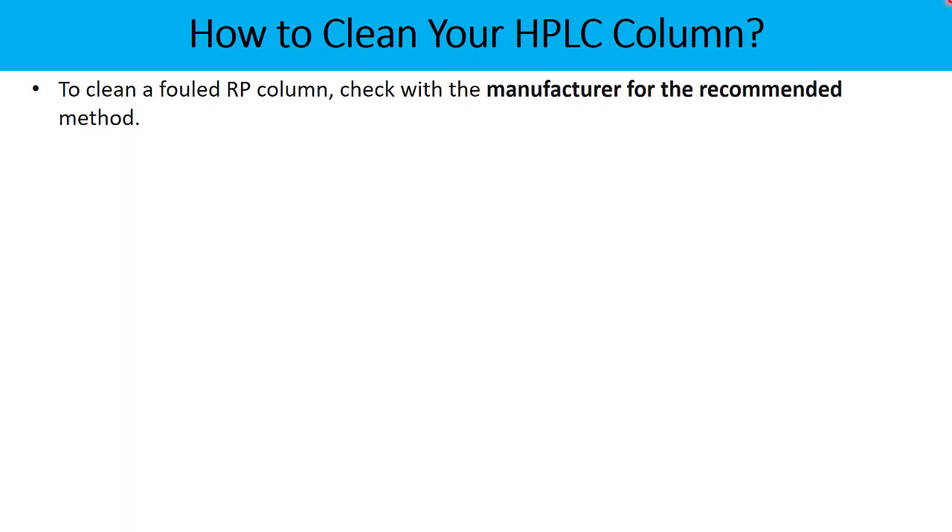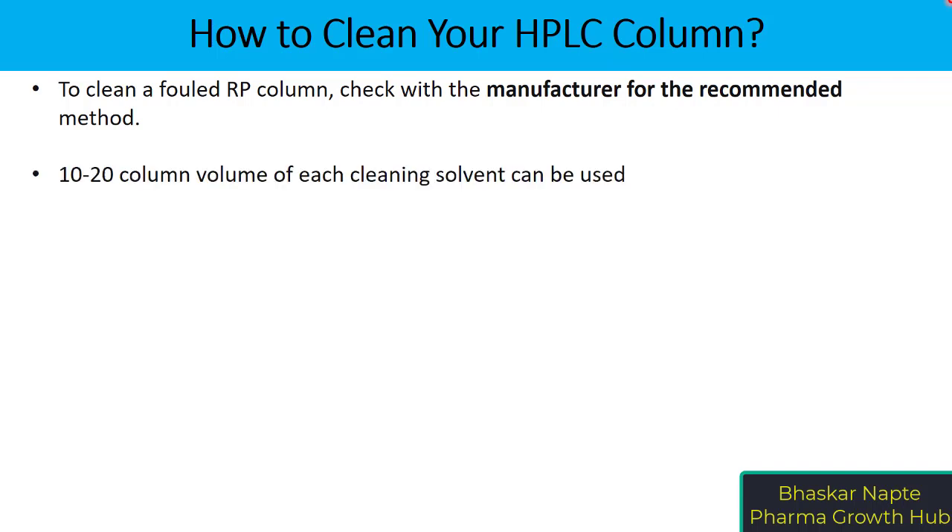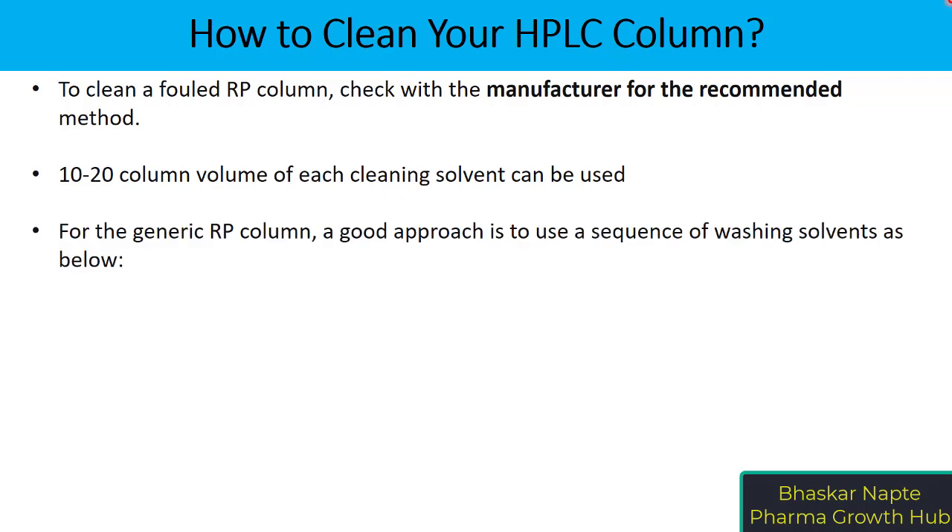The first and foremost, it is very important to make sure that you follow the manufacturer's recommended cleaning procedure. It has always been said that 10 to 20 column volumes of each cleaning solvent can be used during the cleaning process.